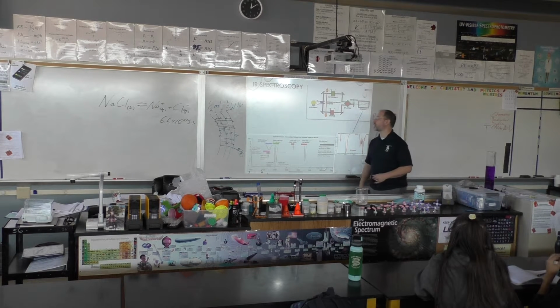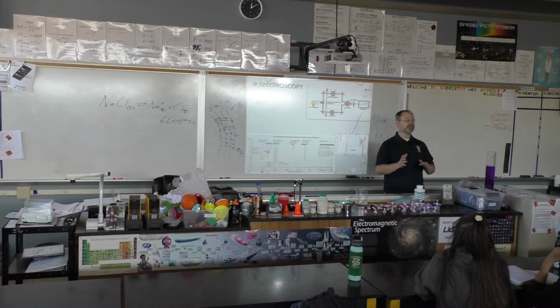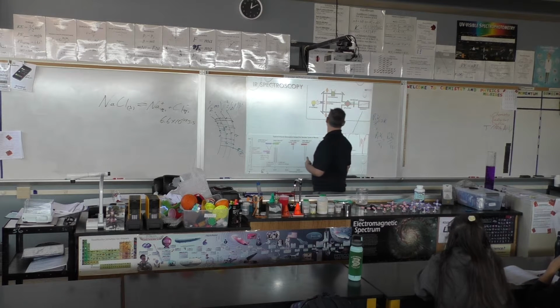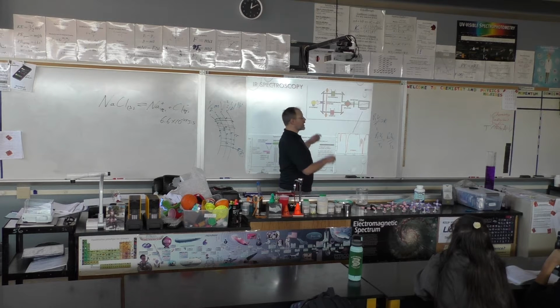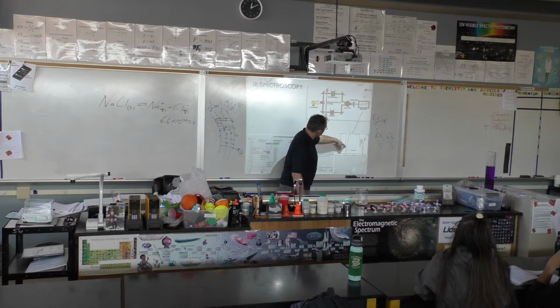So basically how an infrared spectrometer works, infrared is lower than UV vis, okay? Lower in energy. Infrared happens to be just the right bond length, or just the right frequency to be absorbed into bonds. Here's the great thing about water vapor. It has bonds. So this is why water vapor emits infrared light and absorbs infrared light. So what happens with infrared is instead of using UV vis, we shine infrared light through a reference and a sample, and then it absorbs energy based on bond length.